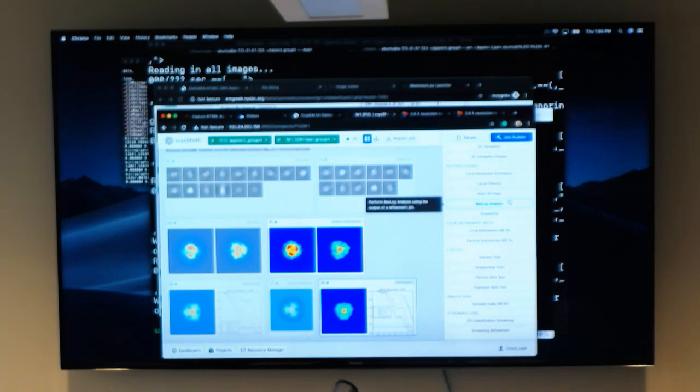So it may not be worth collecting any more particles, because if you add of like kind, you're at a resolution limit. Or if you say, well, I added 1,000, I'm at 5, I added 2,000, I'm at 3, okay, great, I'm just going to collect more because I'm at that slope. I haven't plateaued yet. I can add a few more, and I can definitely improve resolution with minimal overhead.